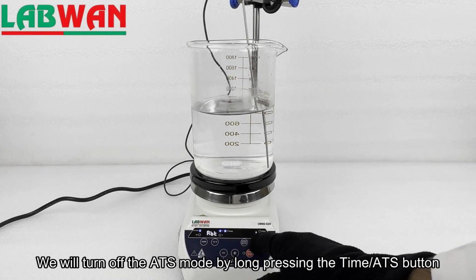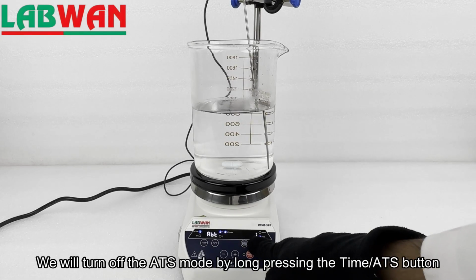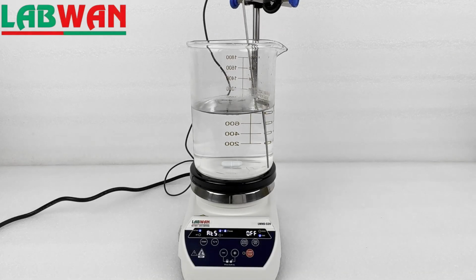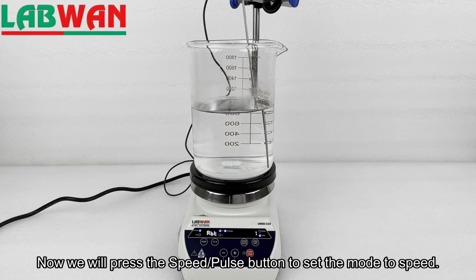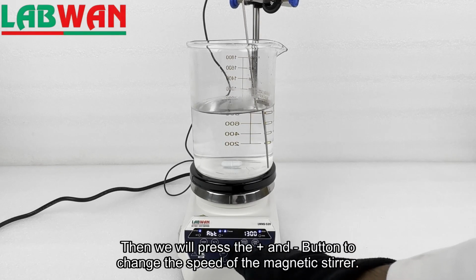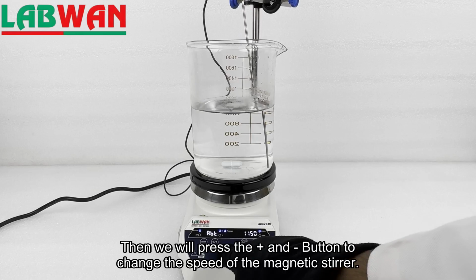We will turn off the ATS mode by long pressing the time, ATS button. Now we will press the speed, pulse button to set the mode to speed. Then we will press the plus and minus button to change the speed of the magnetic stirrer.